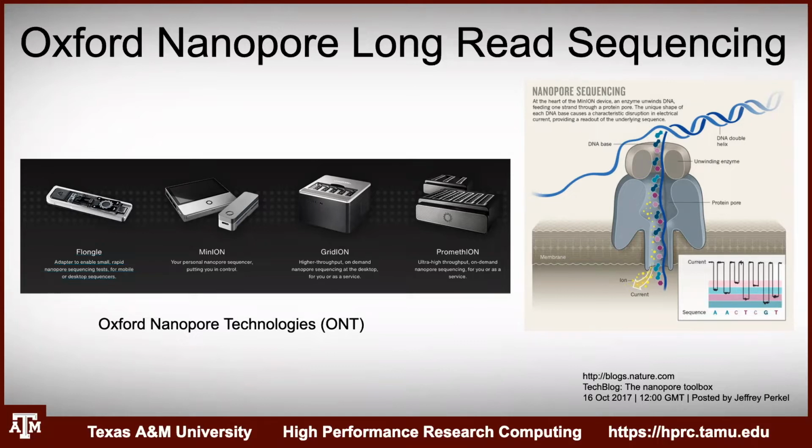If, say, you're in the field, away from all sense of technology, you can sequence on site and have data generated that you can analyze there. As you can imagine, it's got great applications for ecology or disease outbreaks and things like that.